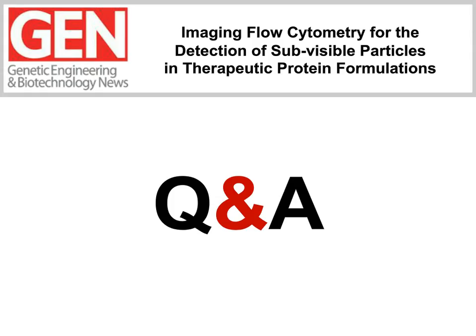All right, and there's another question for you, Christine. Someone wants to know, what is the minimum particle size where protein aggregates and silicone oil droplets can be discriminated from one another using imaging flow cytometry?